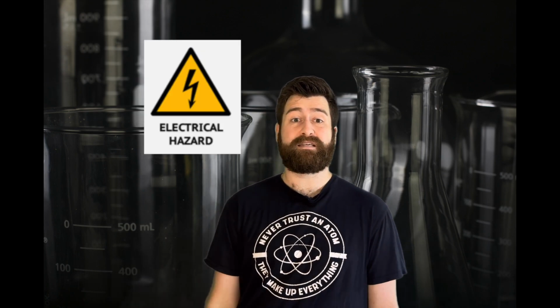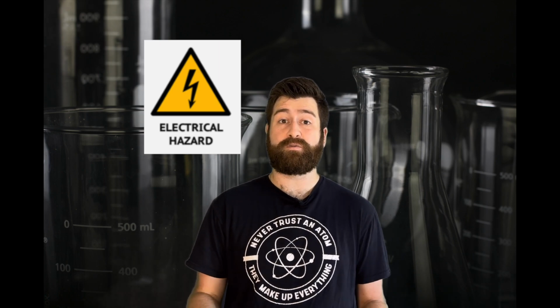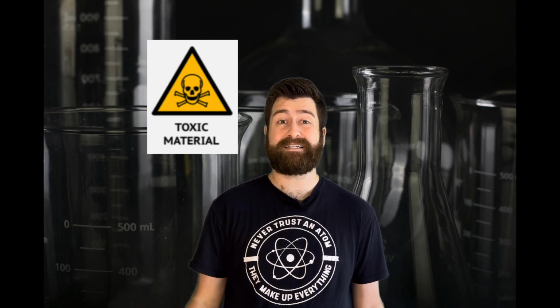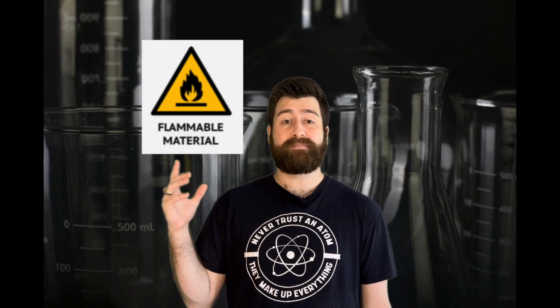This symbol means that it is an electric hazard and that you need to make sure the electricity is off before continuing to work with it or touching it. This symbol means that the material is toxic and you should avoid contact and/or consumption of it. This symbol means that the material is flammable and should be kept away from flames.